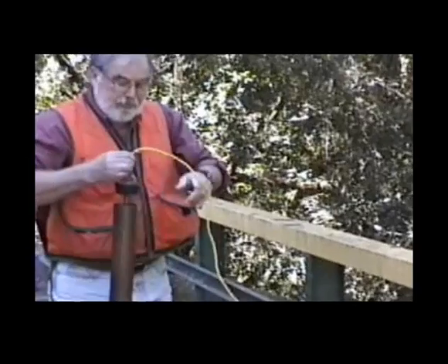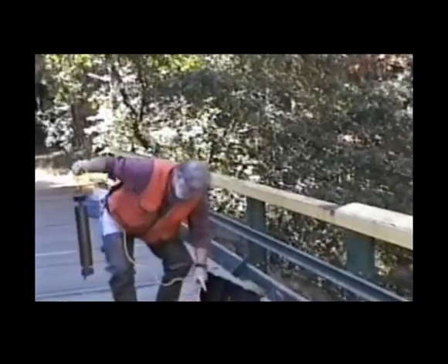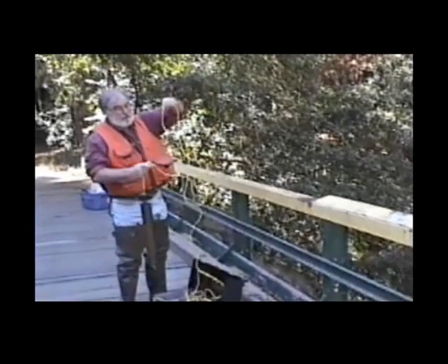The sampler is lowered to the desired depth, which is indicated by marks on the line.